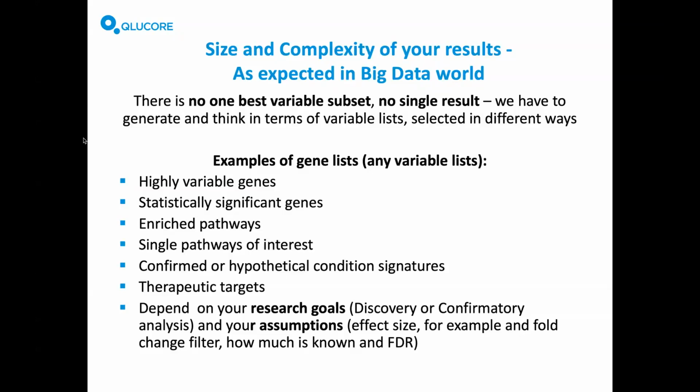Those are the genes which will be introducing the strongest signal in your data, creating patterns. Another take is, of course, looking at statistically significant genes. And then we can look at a number of statistics here. I will set up an ANOVA multi-group comparison and two-group comparisons, and we will use P and false discovery rate Q, Benjamini-Hochberg, to sort and filter results.